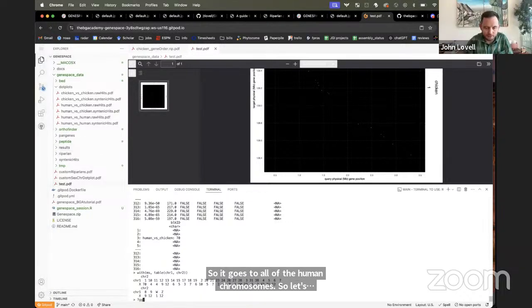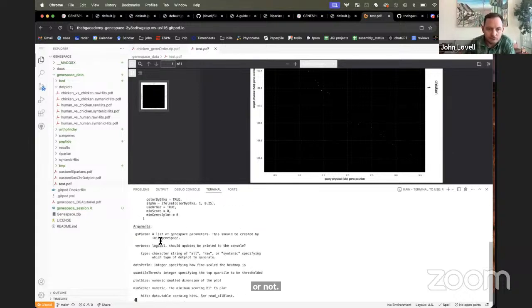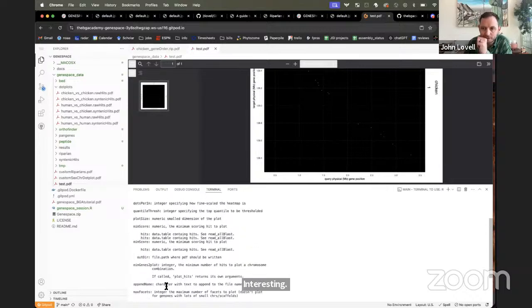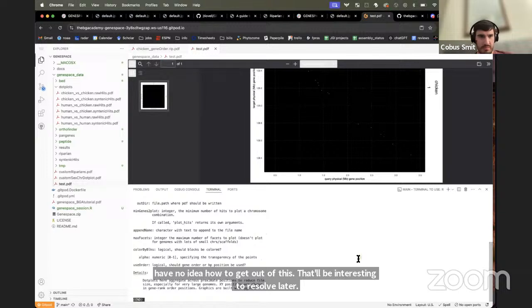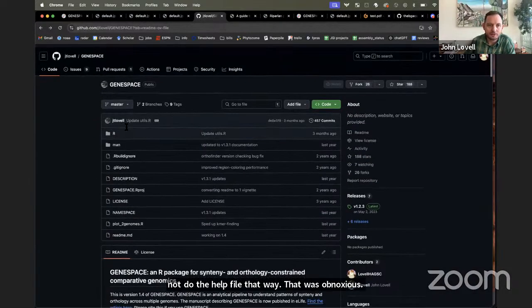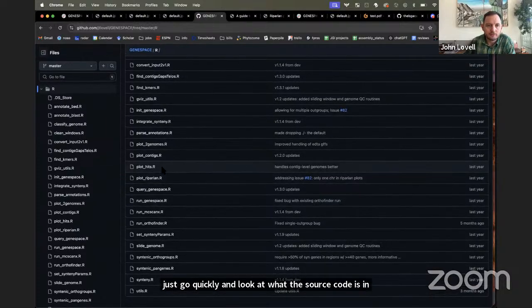So let me figure, I wonder if I can get the help file here or not. Excellent. So the GG hits functionality. Oh wow, it's interesting. All right, I have no idea how to get out of this. That'll be interesting to resolve later. Probably just Q. Maybe, let's see. Yep, that did it. All right, so let's not do the help file that way. That was obnoxious. I'll just go quickly and look at what the source code is in here.